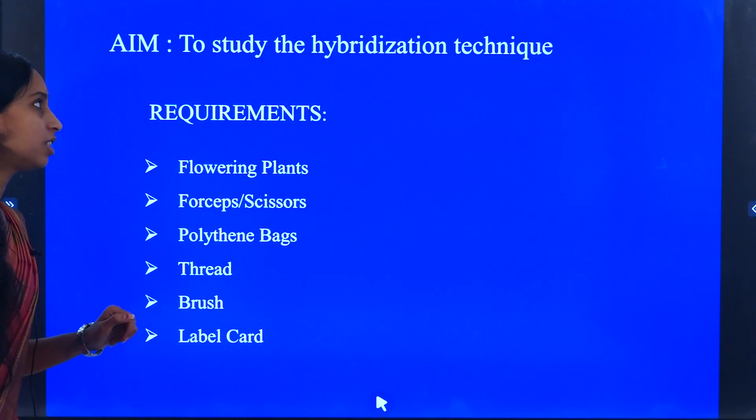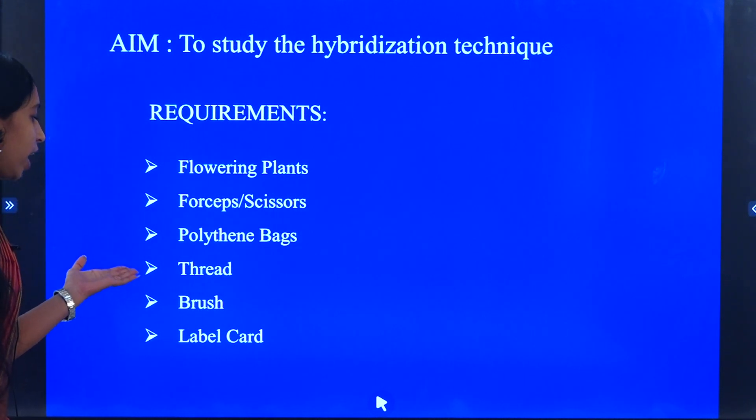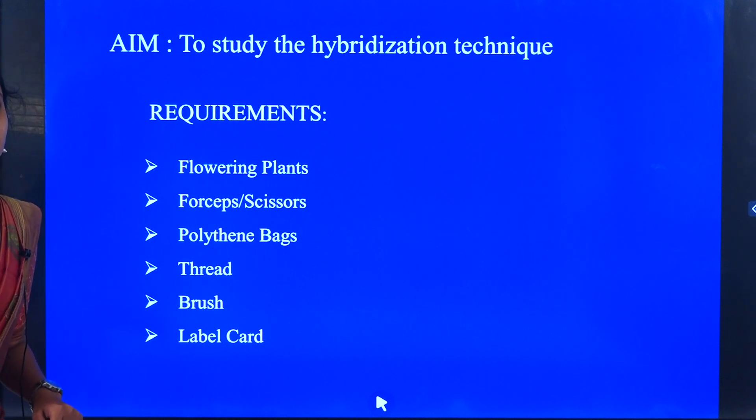The requirements needed for this technique are the flowering plants, forceps, polythene bag, thread, brush, and the label card.